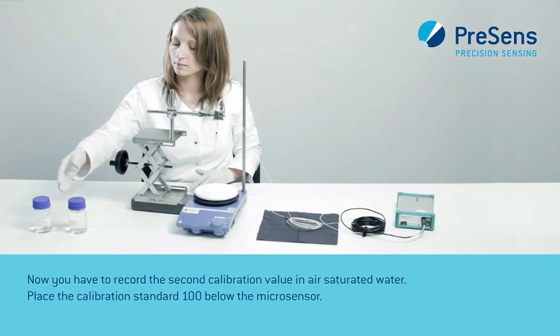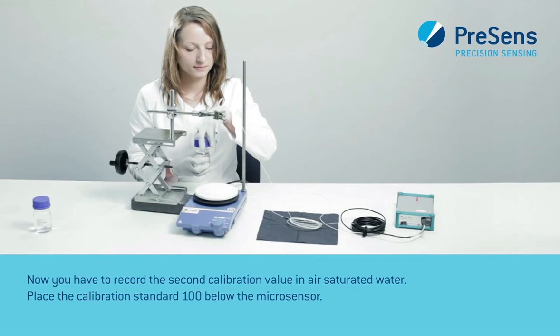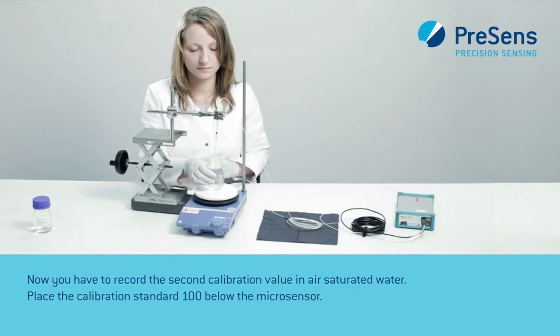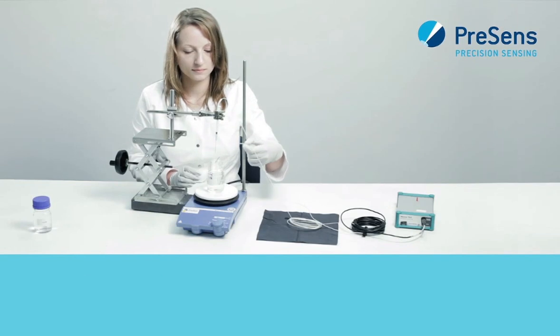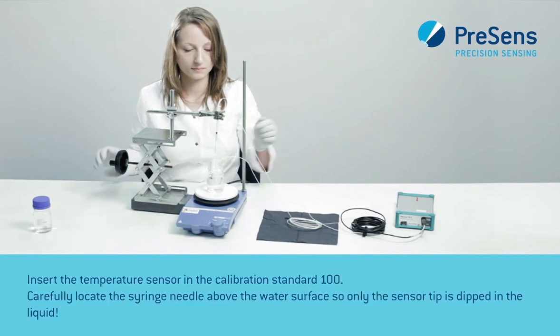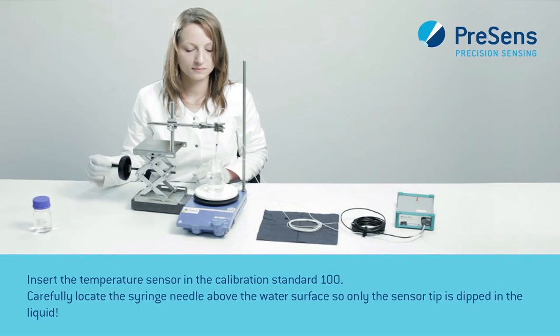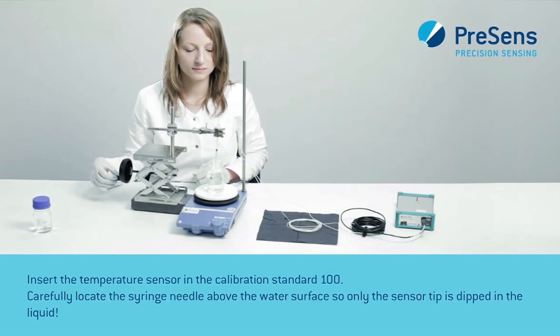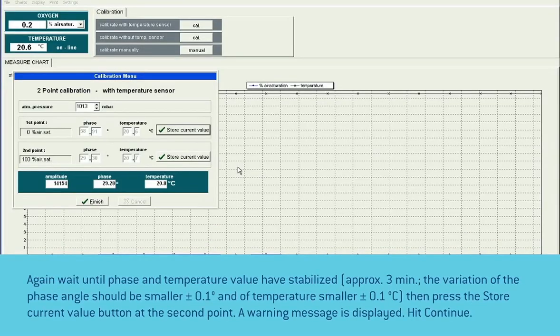Now you have to record the second calibration value in air-saturated water. Place the calibration standard 100 below the microsensor and insert the temperature sensor in the calibration standard 100. Carefully locate the syringe needle above the water surface so only the sensor tip is dipped in the liquid. Again wait for about 3 minutes until phase and temperature value have stabilized and press the store current value button at the second point.